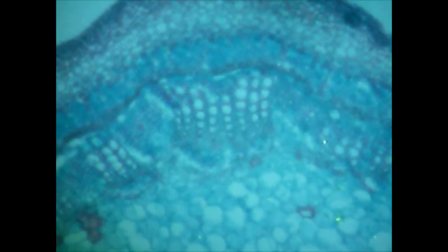Okay, now let's switch to 80x magnification. As you can see, we need to focus. It's easier to focus on 20x, but also in 80 it's not that hard. As you can see, we have more details on the cells with pores.